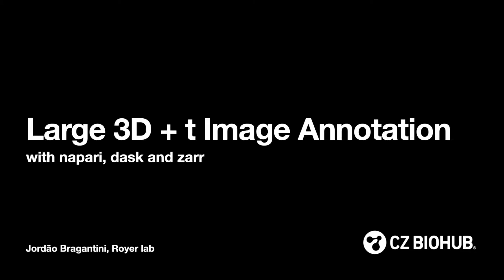Hi everyone, my name is Jordao Bragantini from CZ Biohub, and I'm going to present what we are currently developing for our image analysis pipeline, which at this stage we are annotating our data so we have ground truth to evaluate our algorithms.